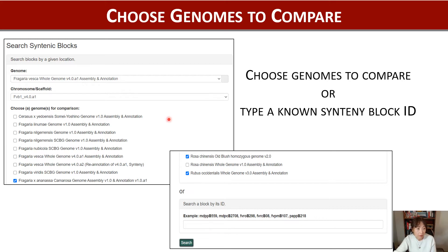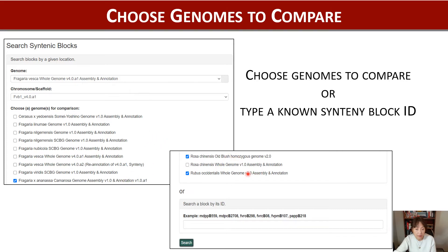For this example, I chose Fragaria vesca version 4, chromosome 1. And then for comparison, I chose Fragaria x-Ananassa, Rosa chinensis, and Rubus occidentalis.